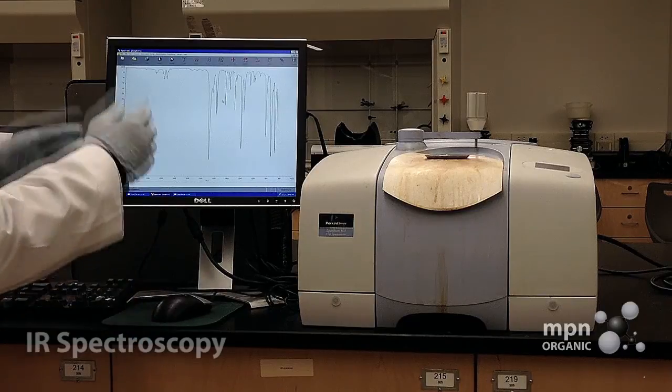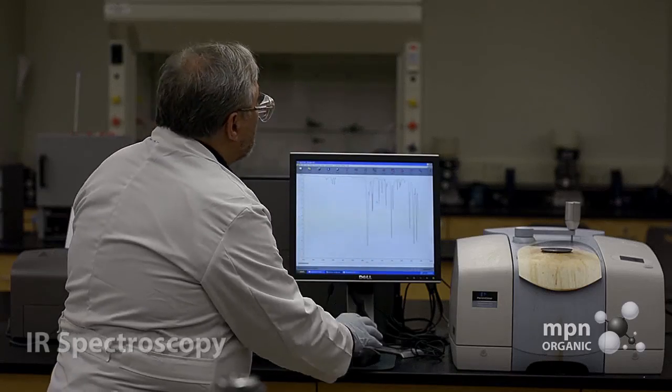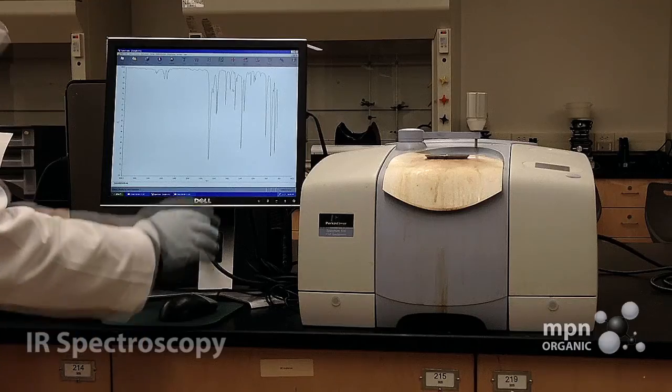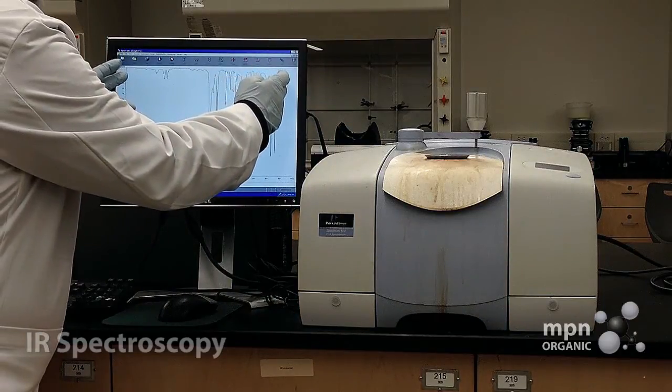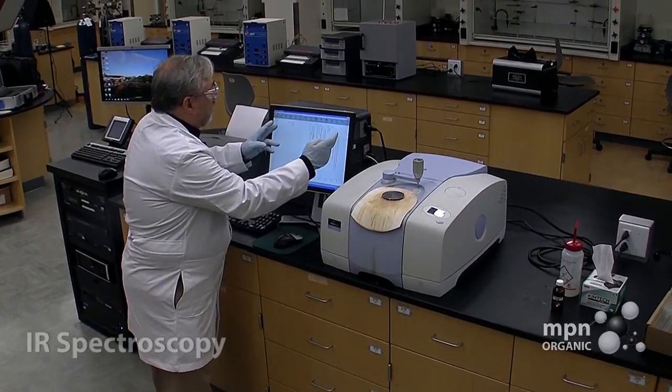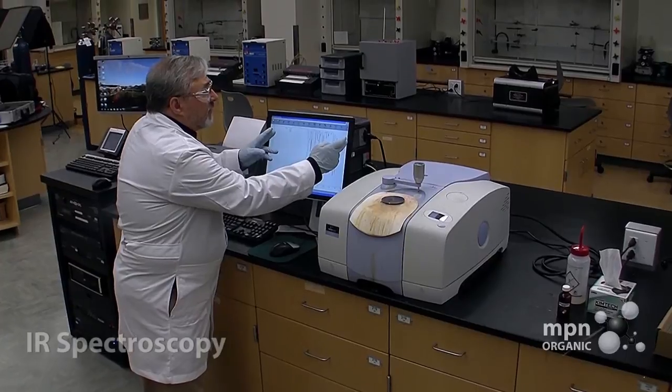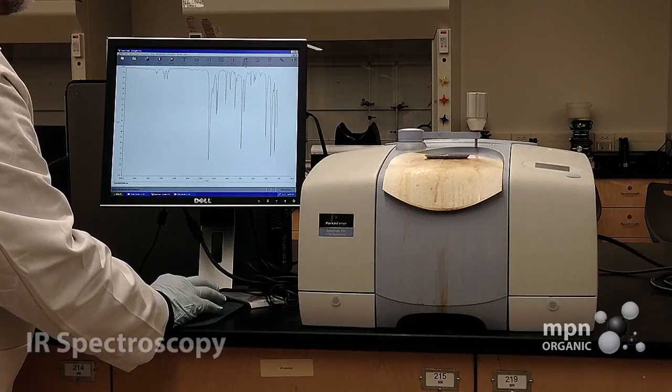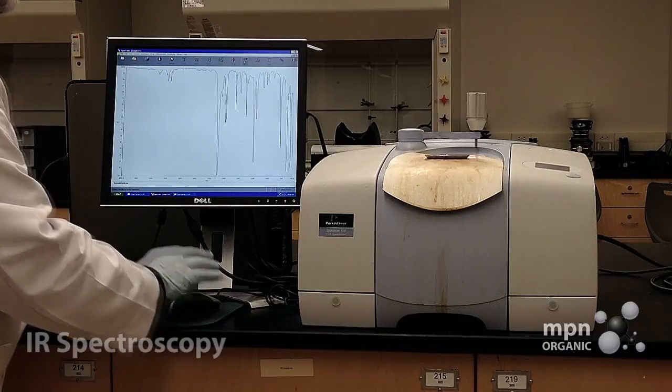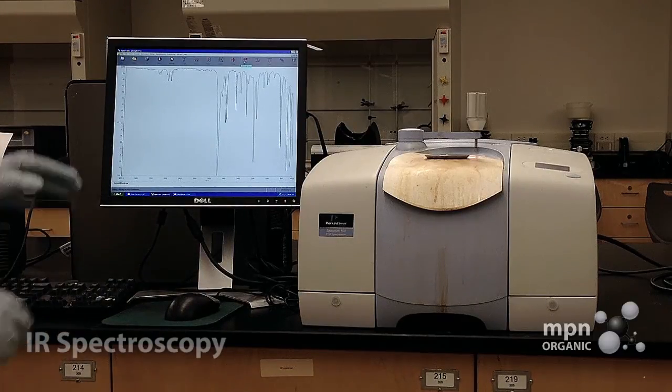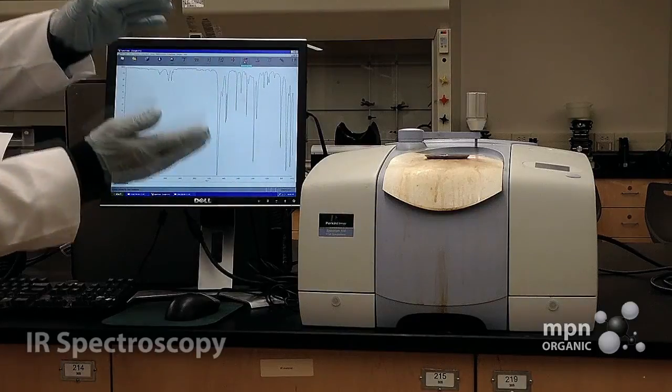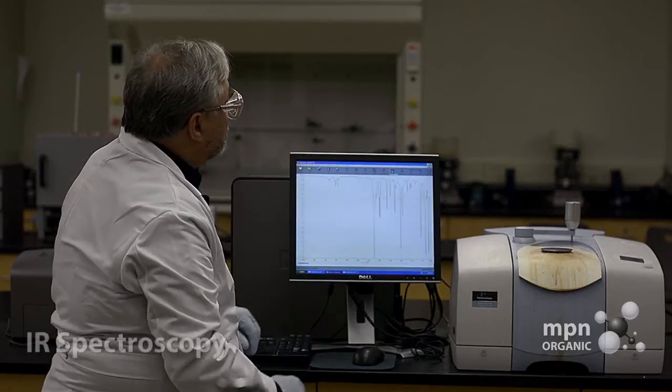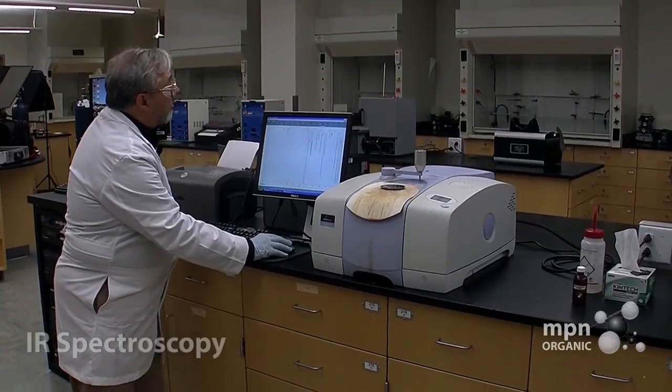And now we're going to prepare it for printing. First thing we're going to do is we're going to expand the x-axis so that it goes from left to right in the extreme. And we do this with opt-view. And there you go, you can see that. Not only does it expand in this direction, but also in the y-direction as well.